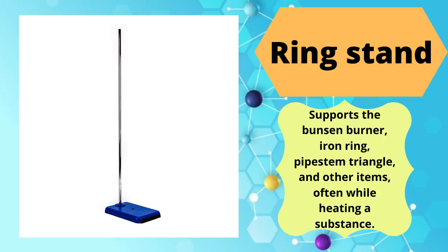Ring stand, supports the Bunsen burner, iron ring, pipe stem triangle and other items, often while heating a substance.